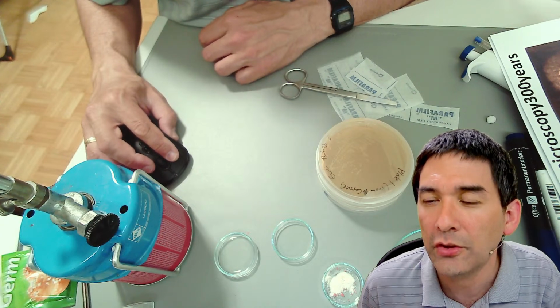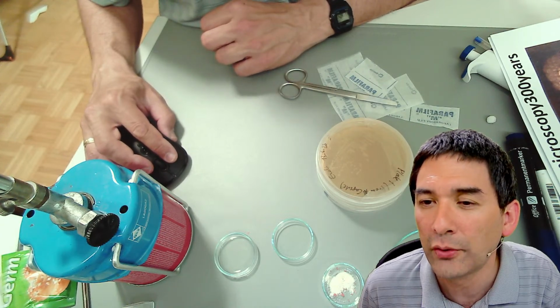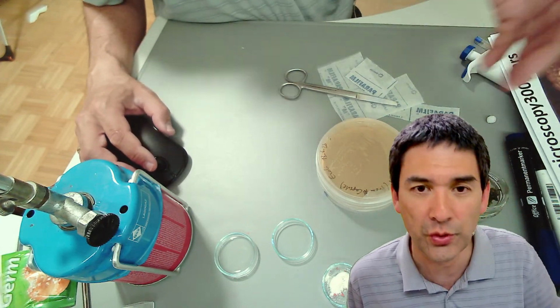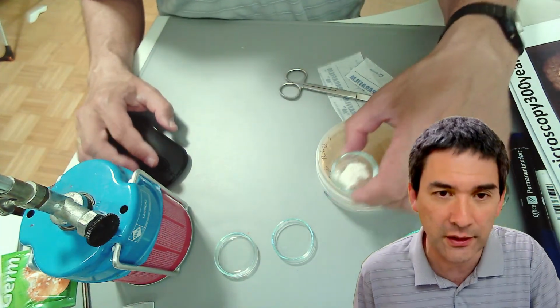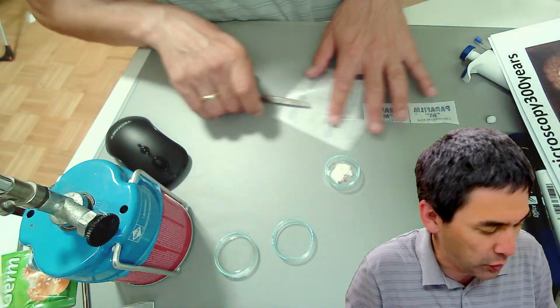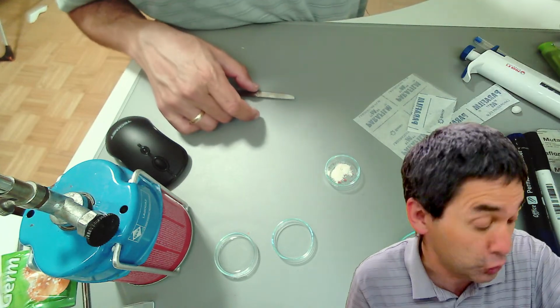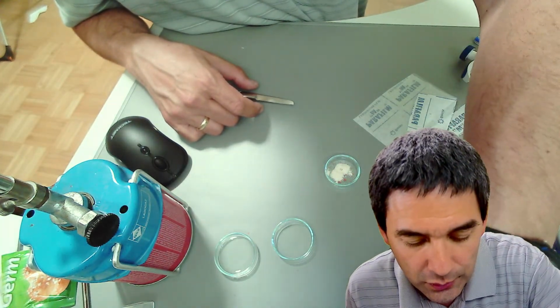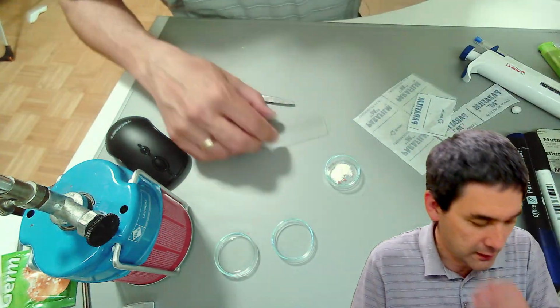Could you show the freeze-dried E. coli powder under the microscope? Okay, why not? So the question was, can I not put this one directly under the microscope as well? Yes, but I'm not quite sure whether we're able to see quite a lot. I've not tried it, but that's actually one of the things. Why not? Okay, so why not try it?